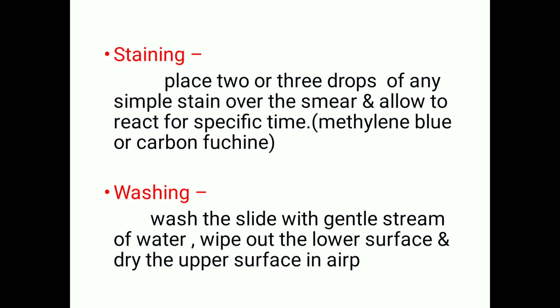Then after fixing, staining. We simply place two to three drops of a simple stain, for example methylene blue or carbol fuchsin, on the smear, and allow it to react for a specific time, one or two minutes. After the staining, wash the slide gently with water, wipe the lower surface, and dry the upper surface in air.